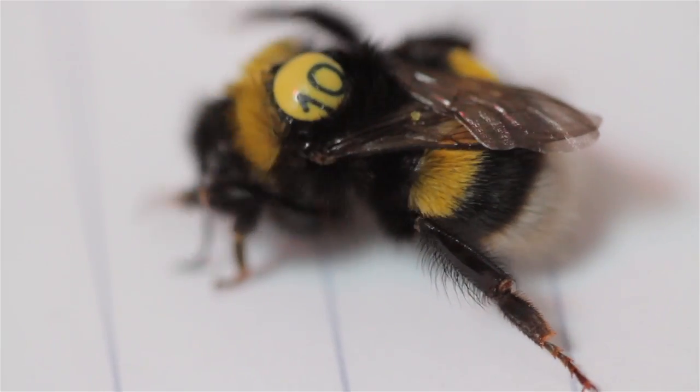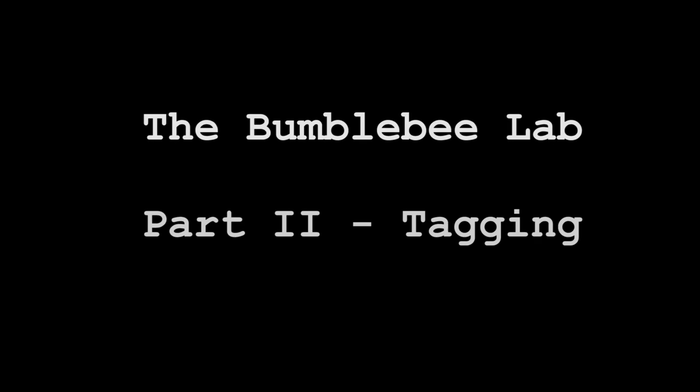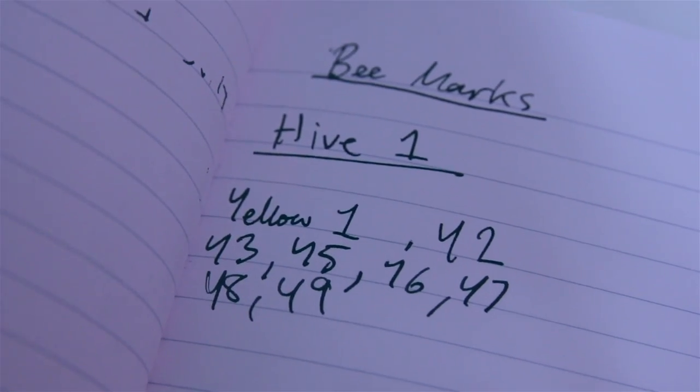You can see she's pretty much totally woken up now. It'll just be a matter of time before she flies into the camera. So today we're going to be tagging some bees, and the reason for that is because I would like to investigate how their experience of their environment affects the bees yet to be born.